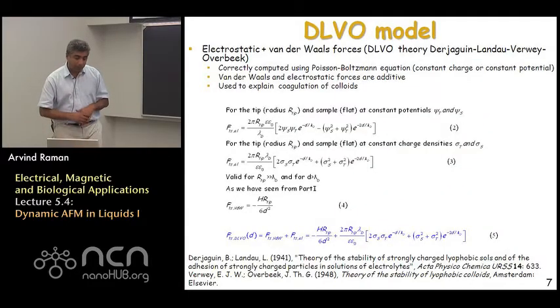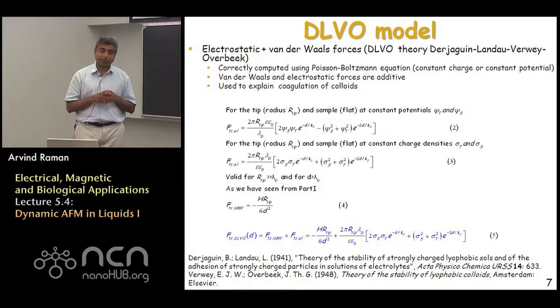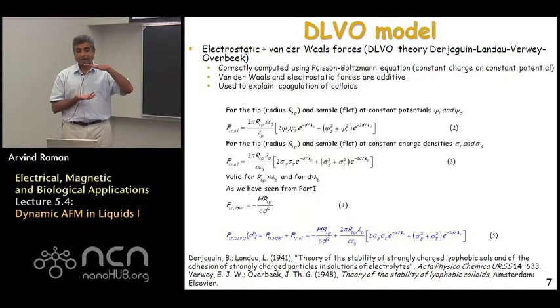All right, so when you're dealing with trying to understand the forces between the tip and the sample in such an ionic medium, there is a very commonly used continuum approach, which is called the Poisson-Boltzmann equation, and it's really the solution of the Poisson-Boltzmann equation that is able to tell us what the force is between the tip and the sample as a function of distance. However, when solving the Poisson-Boltzmann equation, which is a partial differential equation, one needs to supply some boundary conditions to it.